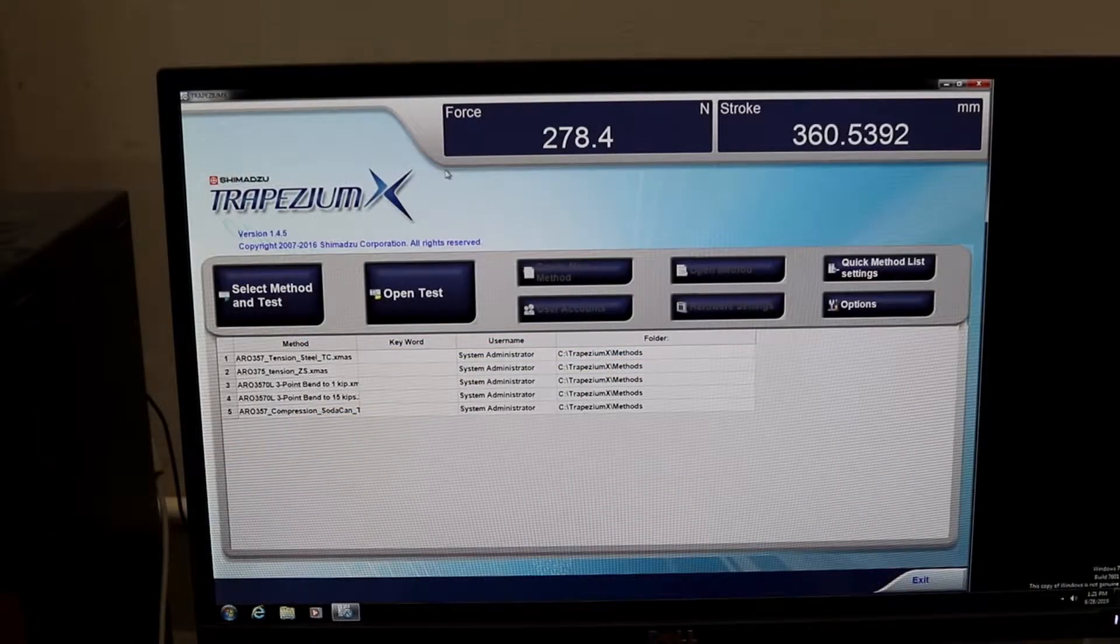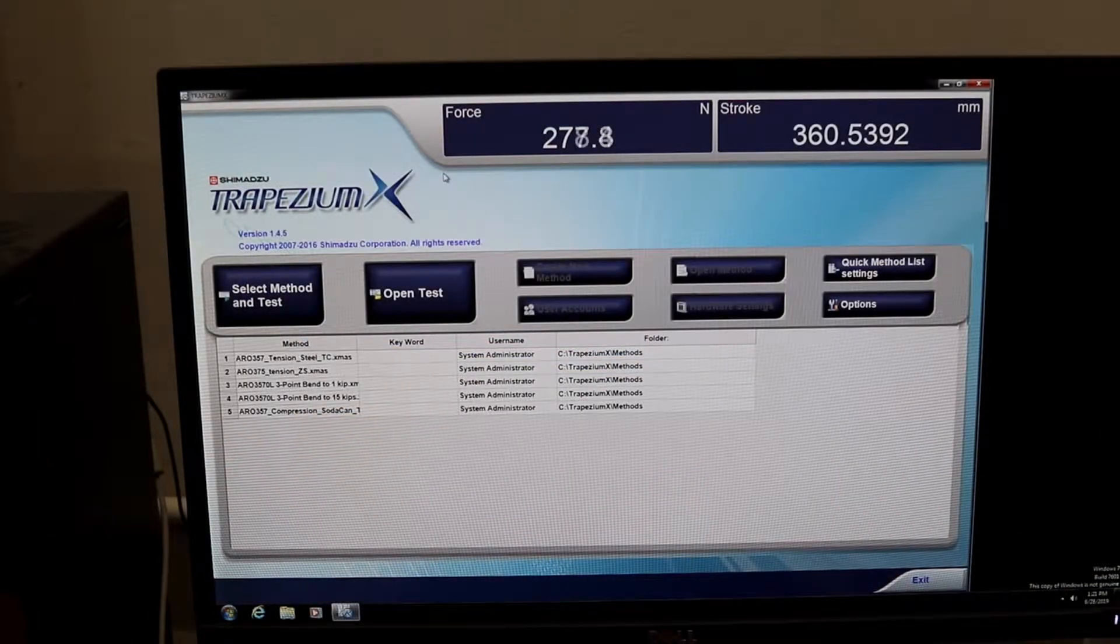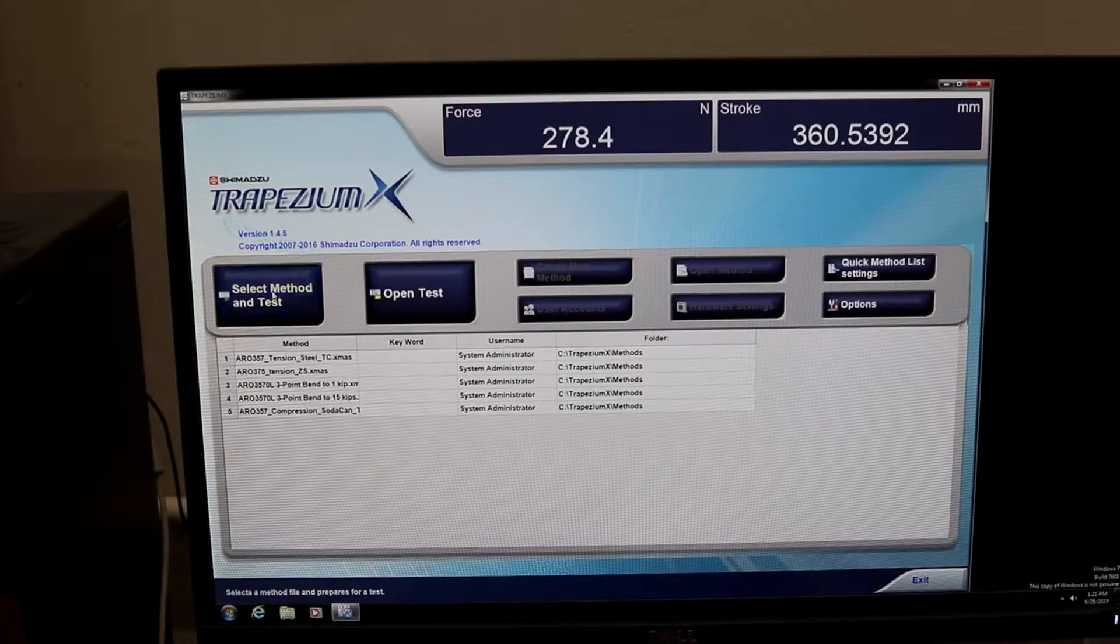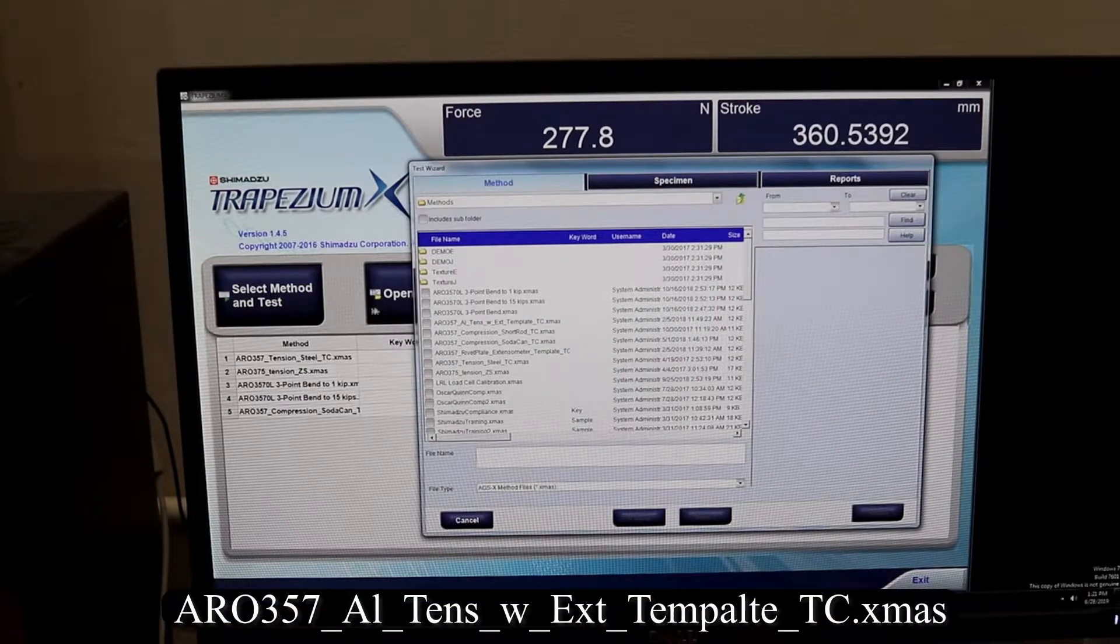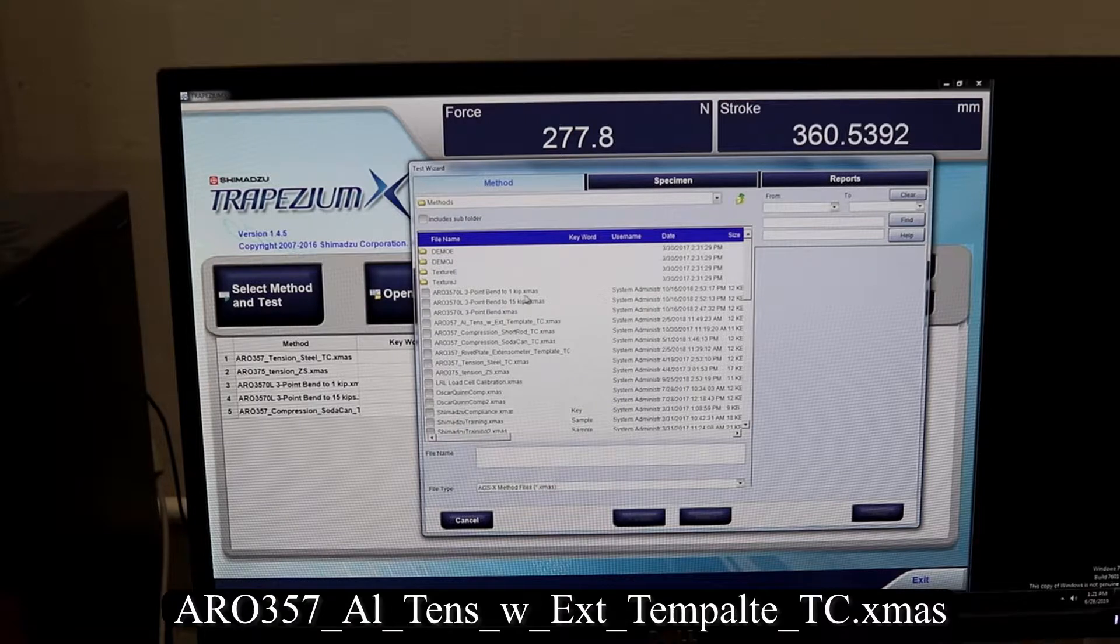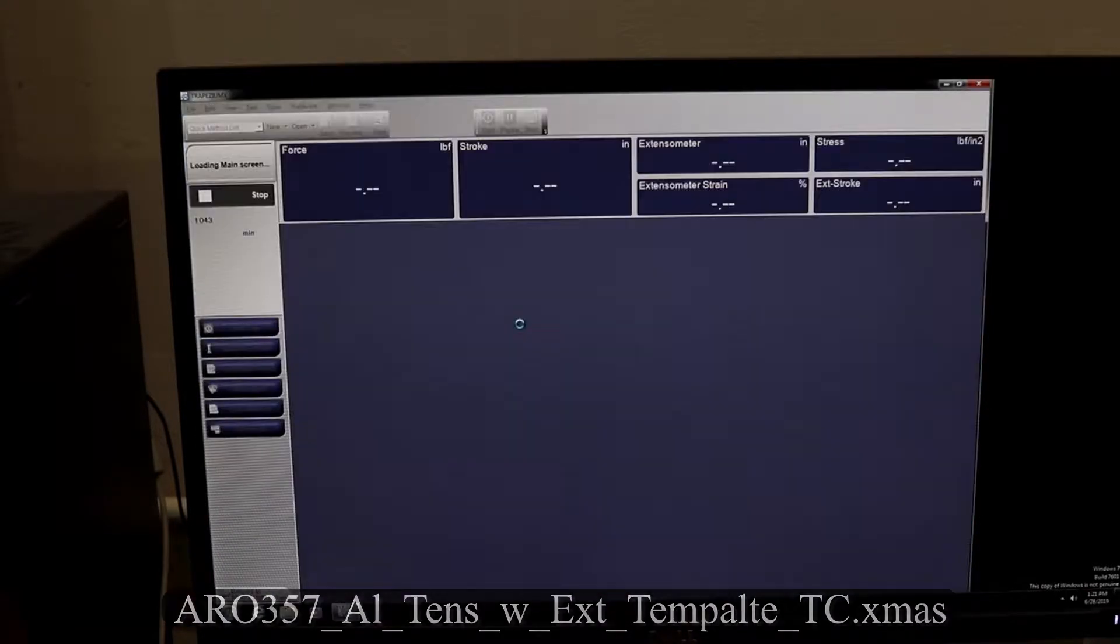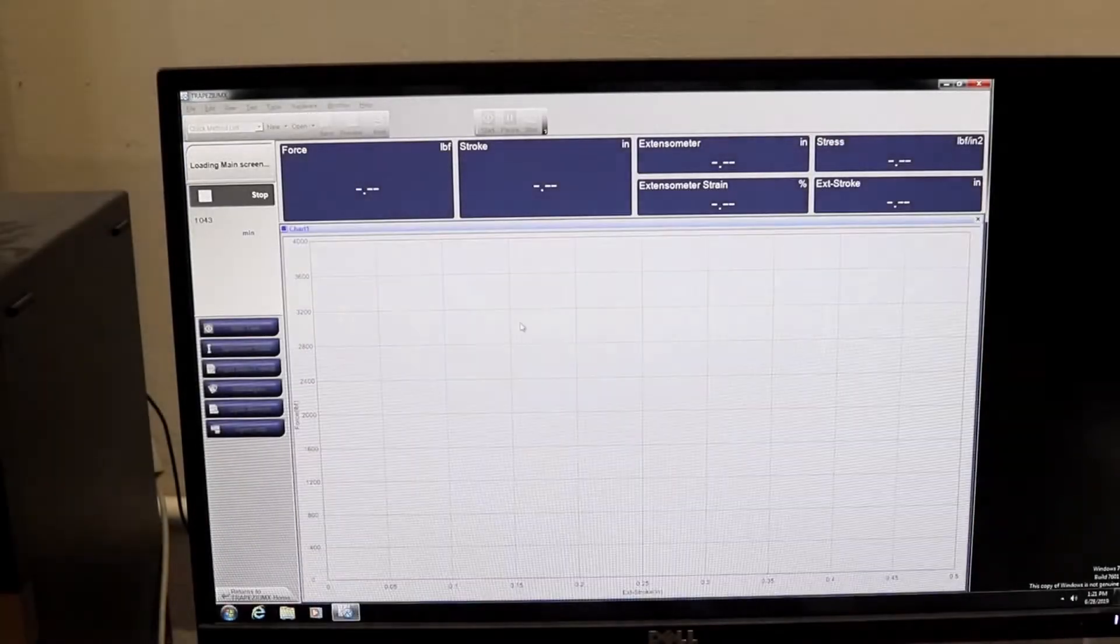Now we click select method and test. This will bring up a list of files for us to choose from. We select the file AERO 357 aluminum tense with extensometer template TC.